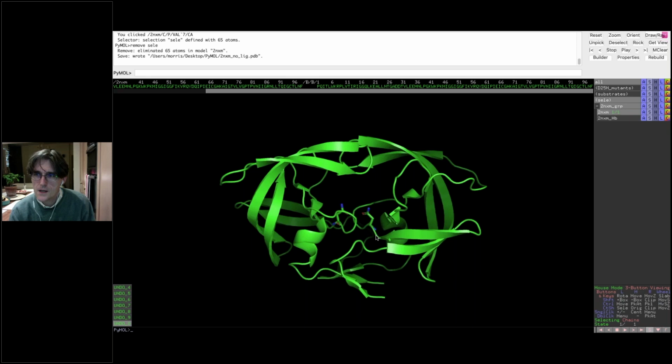Are there any other questions? One question was, how did you get the aligned objects to appear in separate grid spaces? Okay, how do you undo it? Okay, so I'll show you.